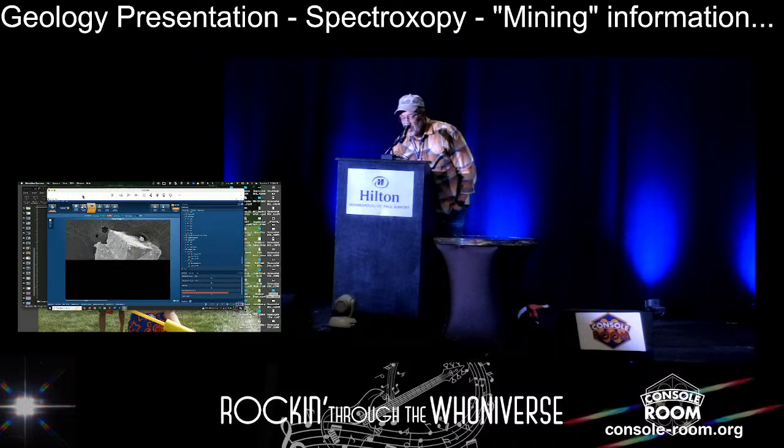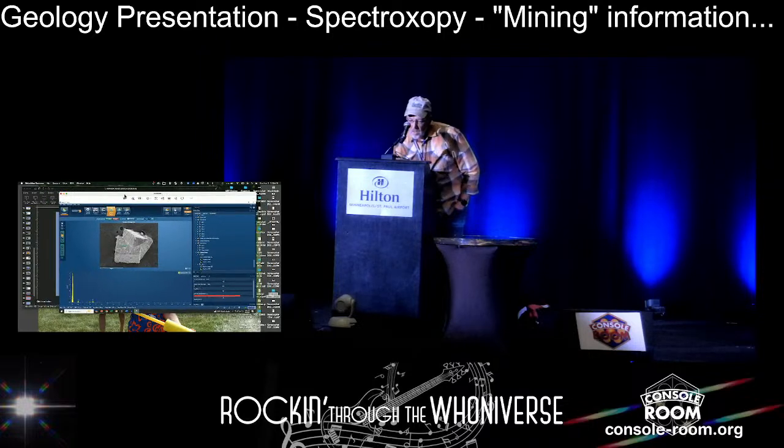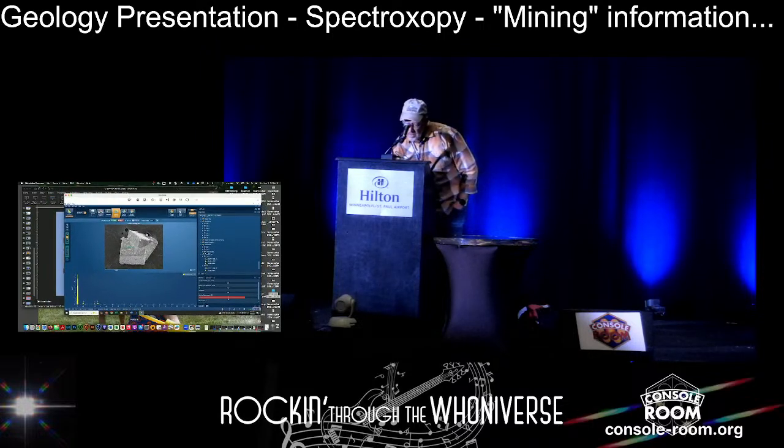So now different computers are actually running this. This is the one that runs the X-ray spectrometer. And if I go here, now I can get a spot and analyze it. So the one thing I'm not seeing much, I'm going to crank up the power a bit. If I can get back to that.